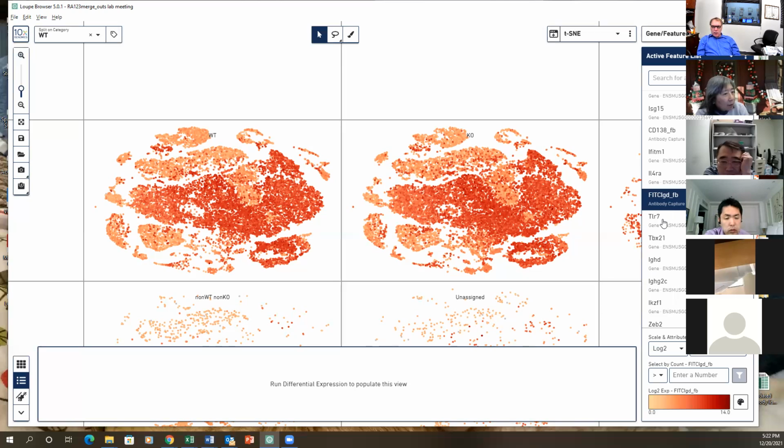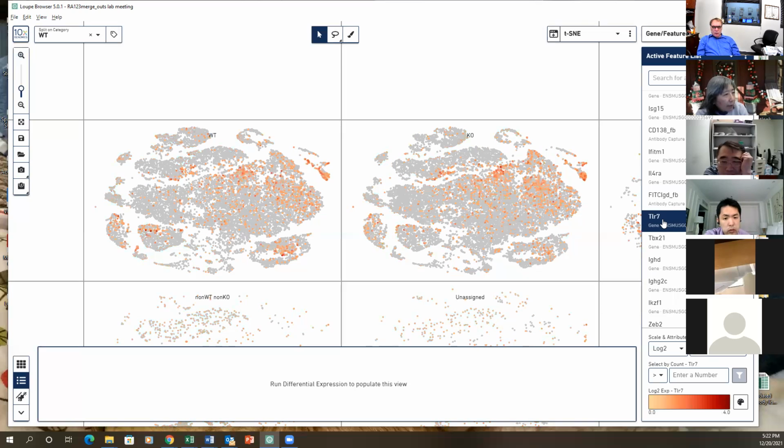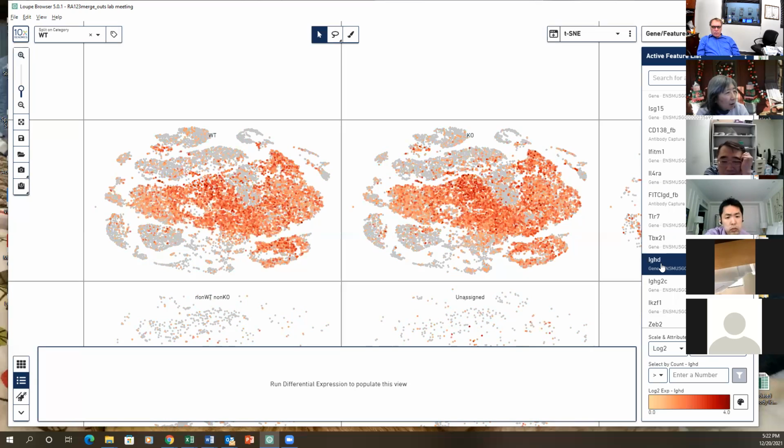What is it? IGD. This is IGD. Okay, keep going. T-bet. This IGD gene. GG2C.